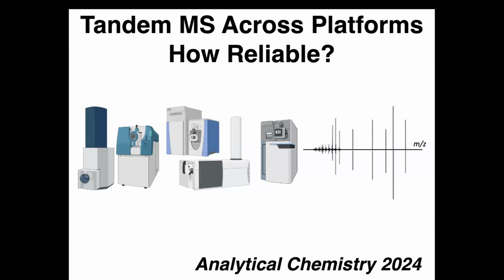We looked at Agilent. Of course, we have the Metlin data from Agilent, but we also looked at the MSMS data that we got from our Bruker instruments, our SciEx, our Waters instrument, our Q Exactive instruments from Thermo, and which one am I missing?